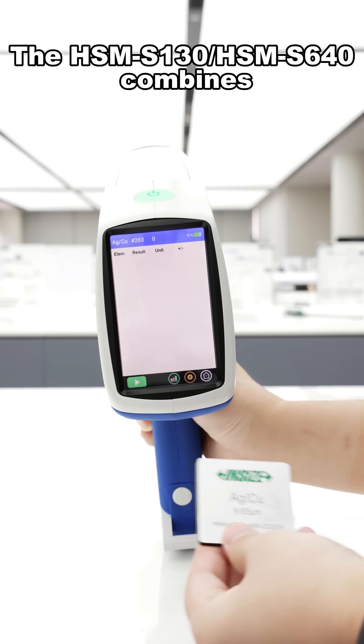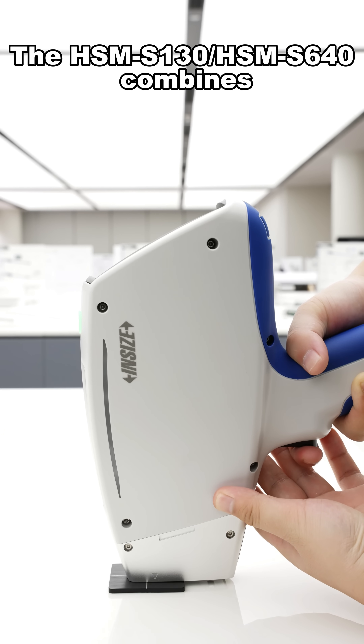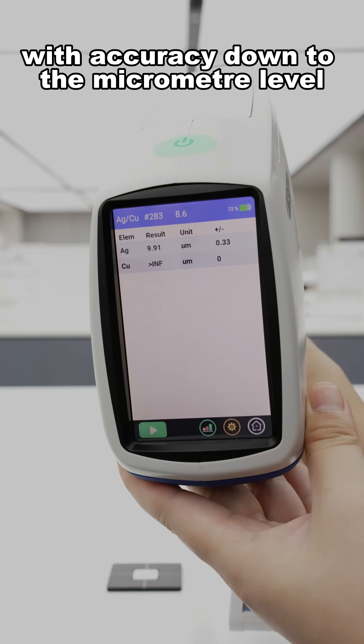The HSM-S130 and HSM-S640 combine coating thickness measurement functionality with accuracy down to the micrometer level.